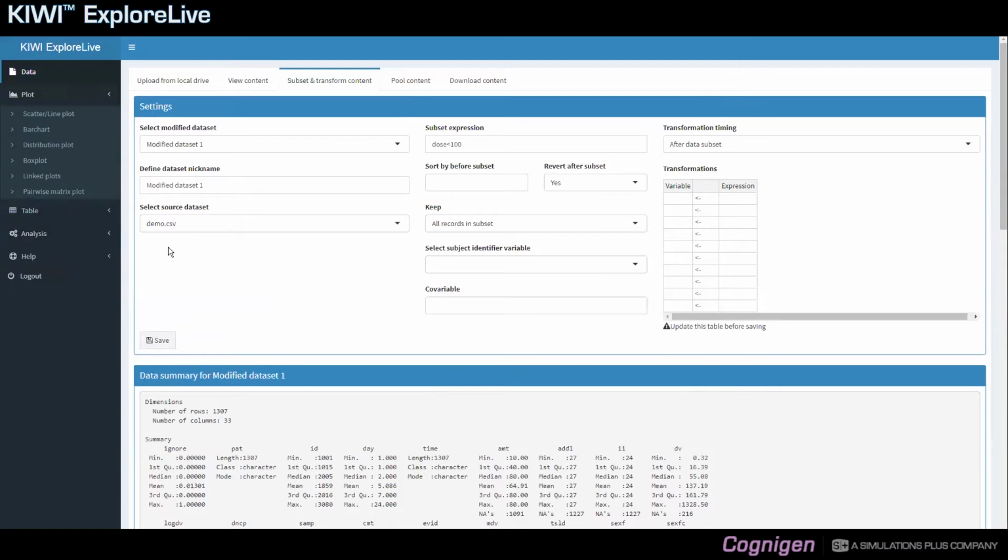So the benefit of subsetting the data in this place is the creation of this data set that can be reused at different places. So you don't have to repeat the steps of subsetting or providing the conditional expression directly in the module.